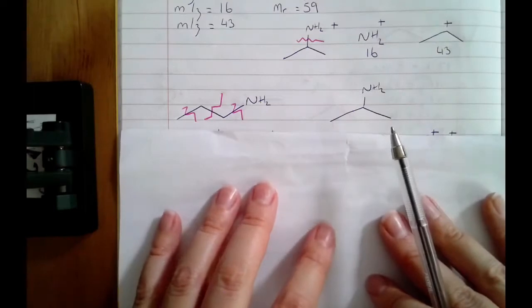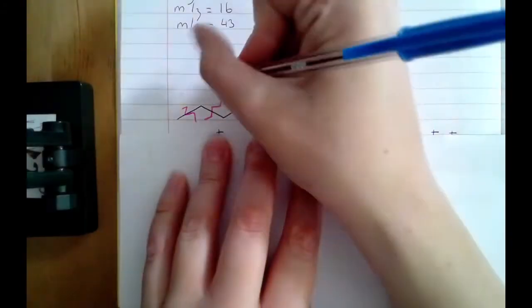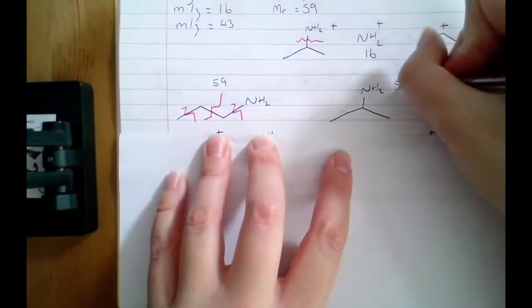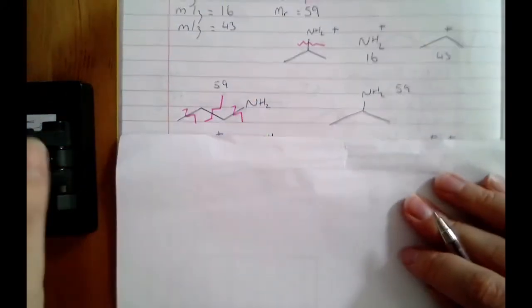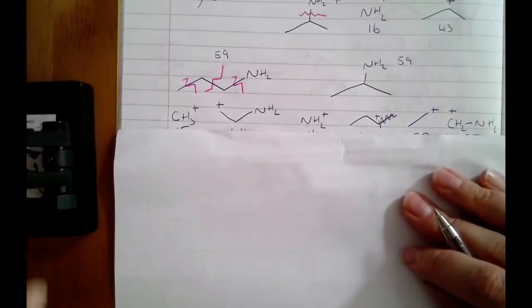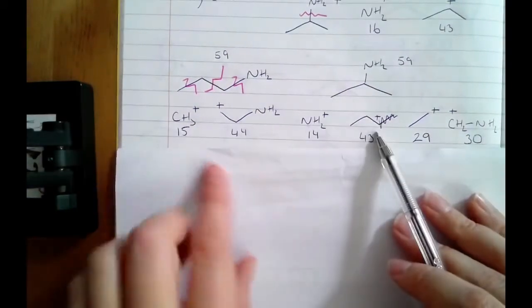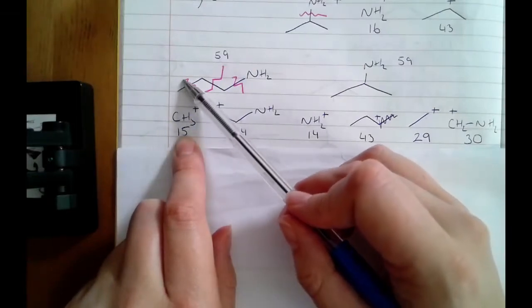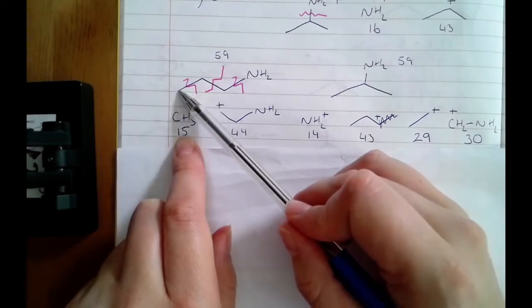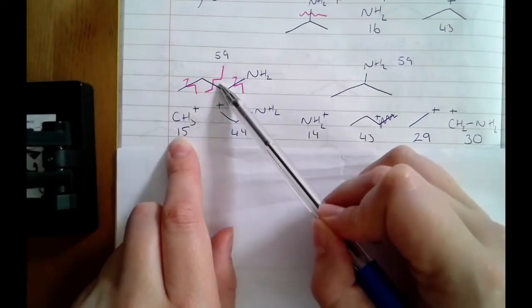In question 2, I then ask you to have a look at 1-aminopropane. So these guys are isomers. They have the same formula mass, so they both have a formula mass of 59. And I asked you what fragments are common to both and what fragments are unique to 1-aminopropane. So if I have a look at the fragments that are common to both, okay, so we saw above that the peak at 15 was caused by a CH3. If I look at my 1-aminopropane, if I were to break this bond right here, I can break a CH3 off my molecule, therefore it's also likely that I get a peak at 15 in 1-aminopropane.